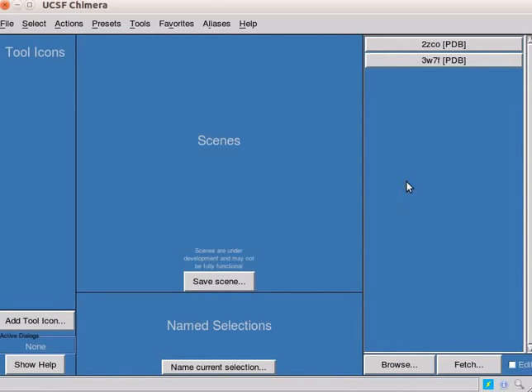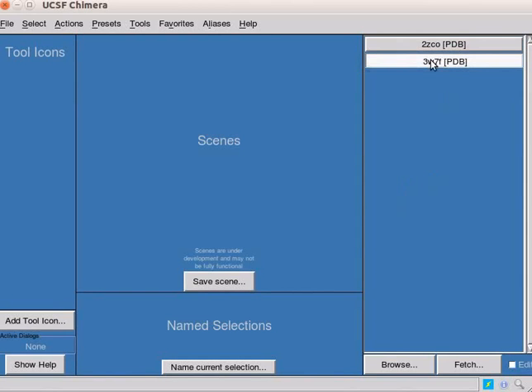Here, I have opened a Chimera window. From the graphic access interface, click on the file 3w7f.